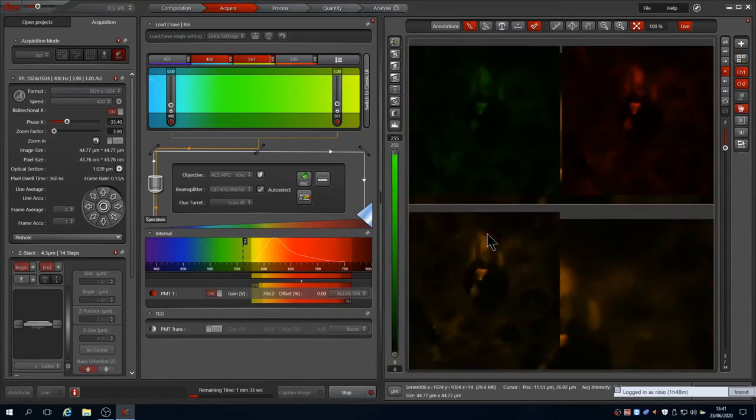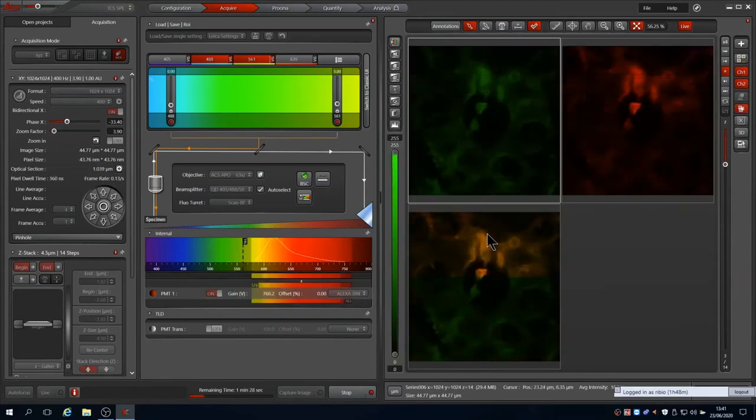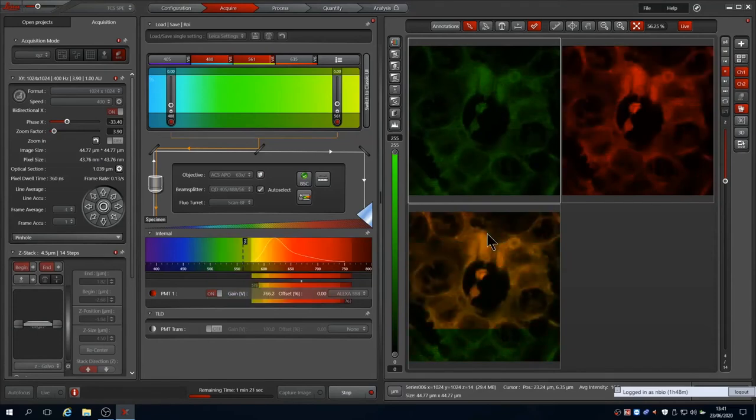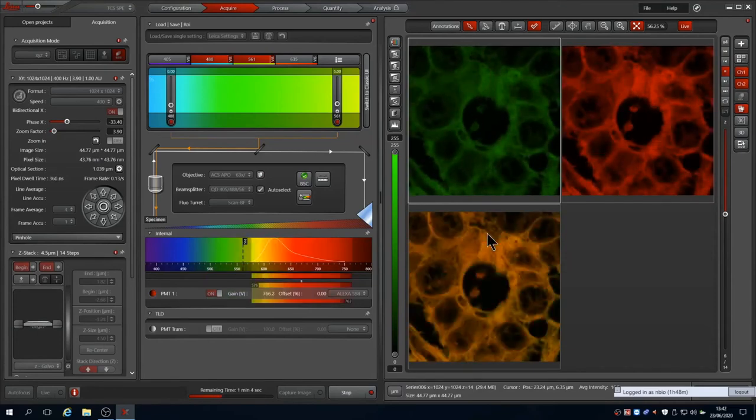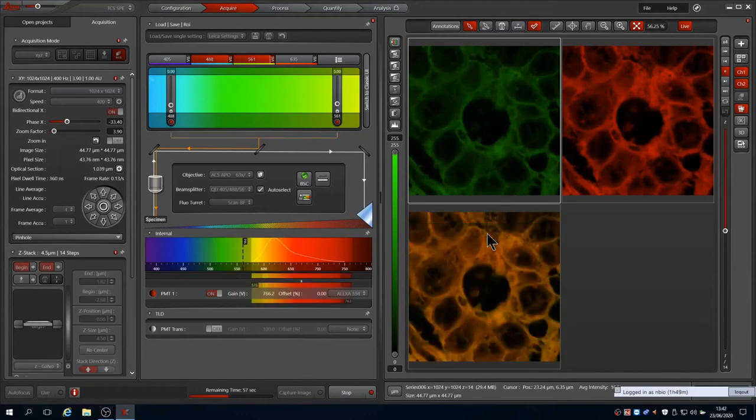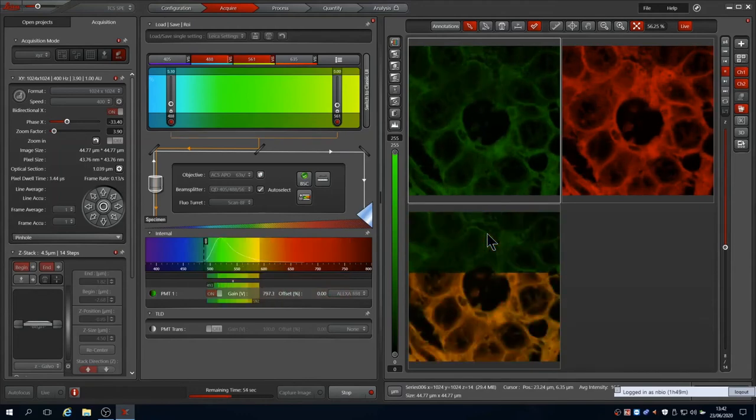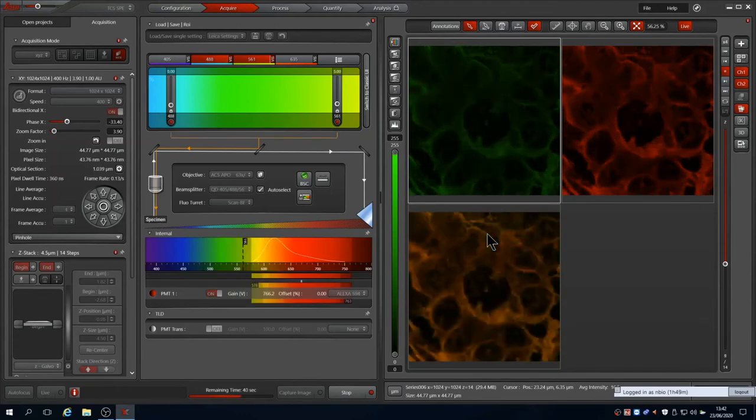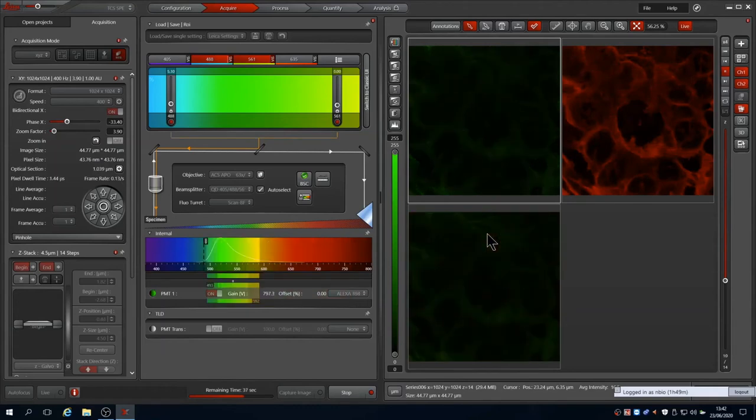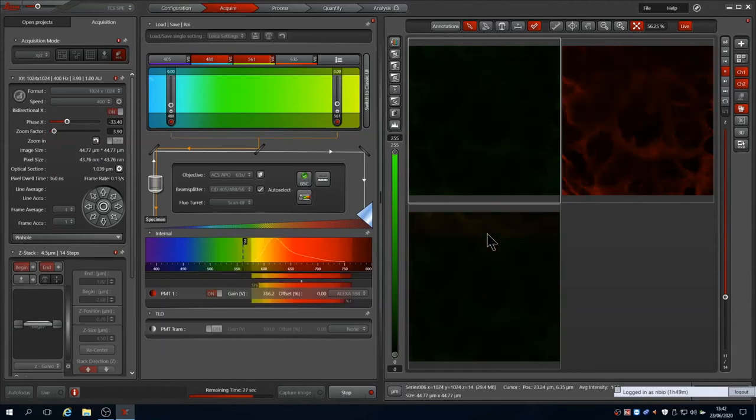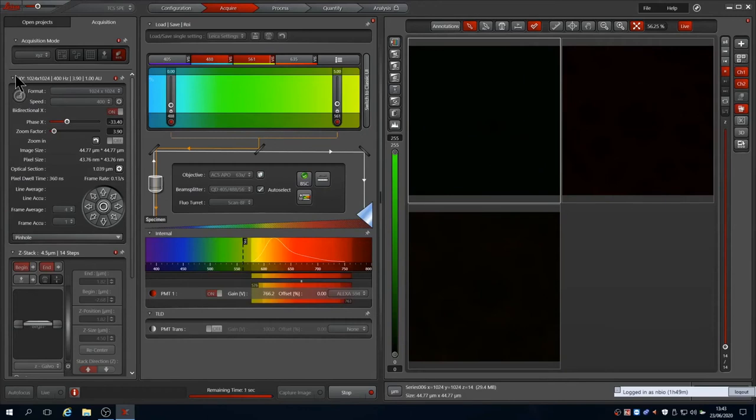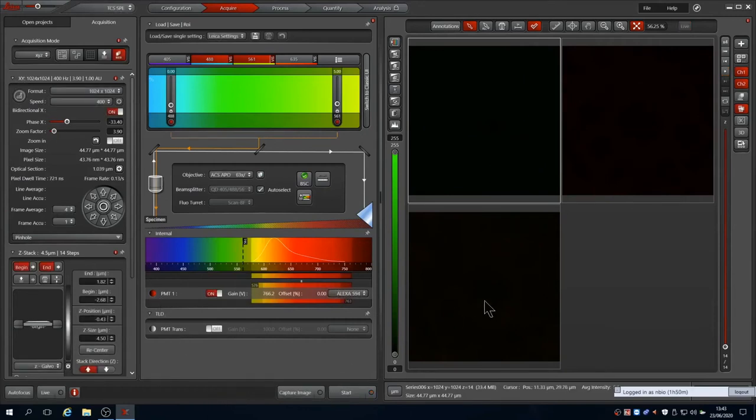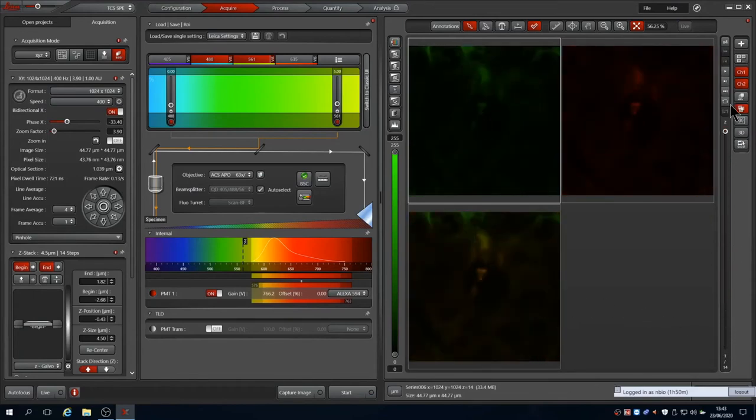You can watch the progress of this in the image window, and at the bottom it shows you approximately how long it has left to image. A slider on the right of the image window allows you to scroll through the stack.